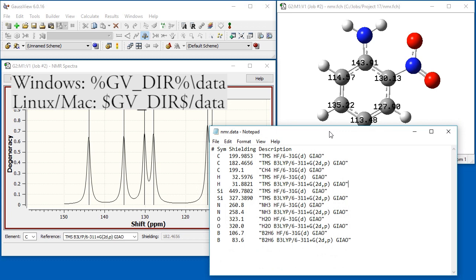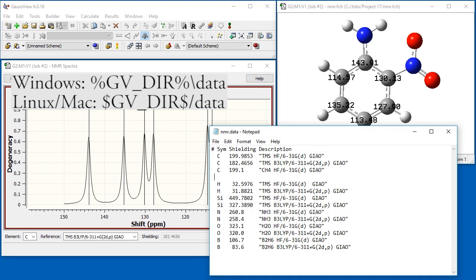Its format is intuitive. Each line consists of the element, the shielding value, and a description enclosed in double quotation marks. Generally, the description includes at least the name of the reference molecule and the model chemistry used to compute the value.